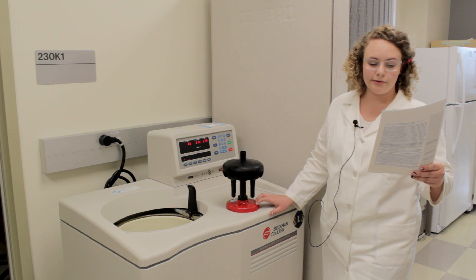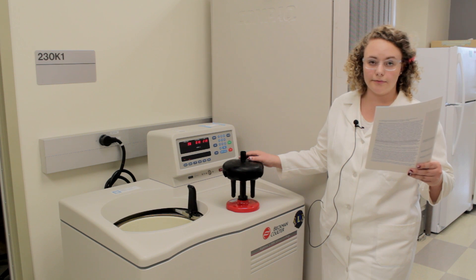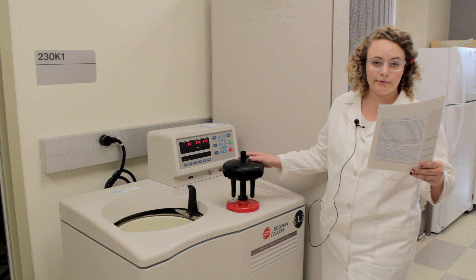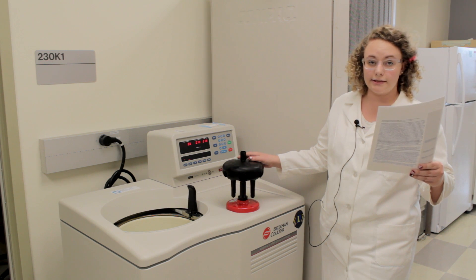Ultracentrifuge is a machine that rotates its rotor at extremely fast rates. This machine is essential for glaucoma research. This machine has the power to separate exosomes released from ocular tissues and from other soluble proteins and lipids.